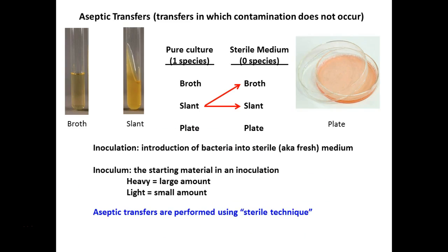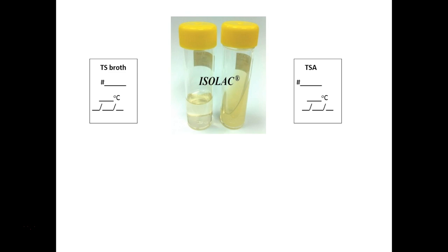So, as I said, sometimes people say sterile technique. I'll typically say aseptic technique, right? And then what we want to do is not contaminate things. So we already did our labels, right? We added our number, the temperature, the date, and maybe even our name or initials. We put them up towards the top of the cap, right?